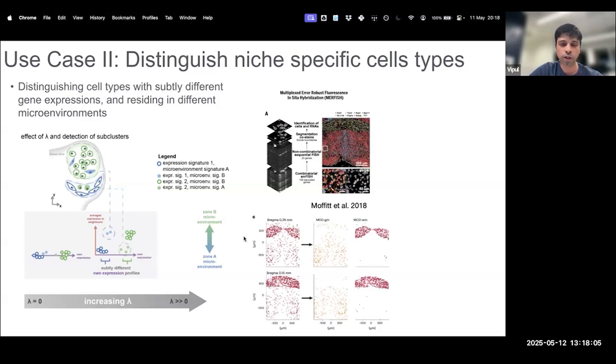And non-spatial clustering marks out one of the populations, the mature oligodendrocytes. And the mature oligodendrocytes sit in the anterior commissure, which is like this highway of projections, and in the general hypothalamic area. So the anterior commissure is a white matter population. The general hypothalamic area is gray matter, right? And BANKSY, because the neighborhood compositions of these mature oligodendrocytes versus these mature oligodendrocytes is so different, is able to separate them out into two subpopulations.